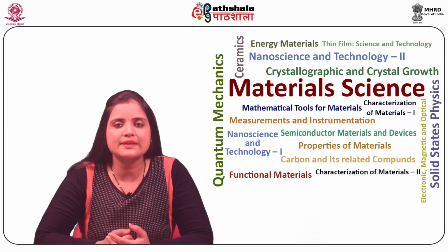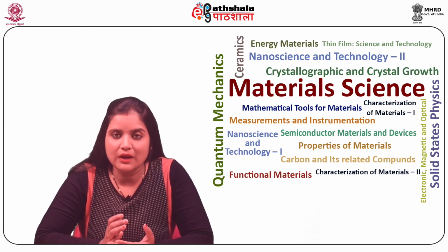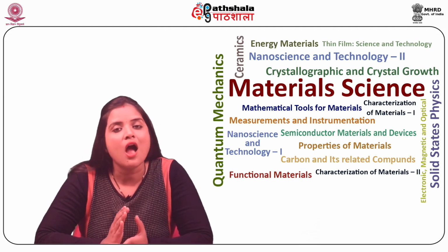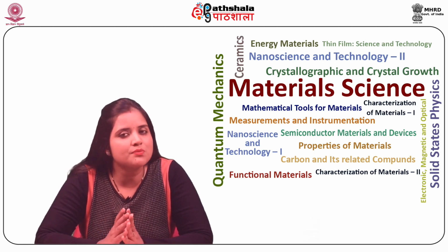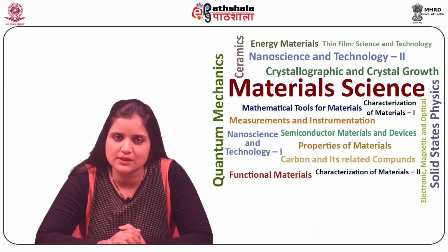Let us now discuss the feedback mechanisms. Feedback mechanisms are usually used to achieve high resolution and artifact-free images, since the detector must be positioned within a few nanometers of the surfaces.